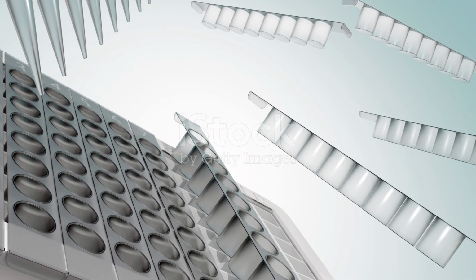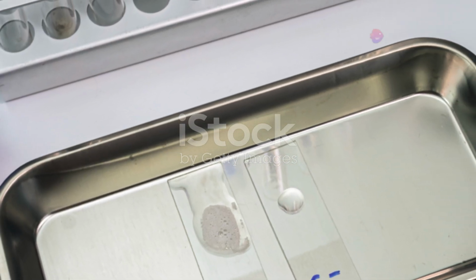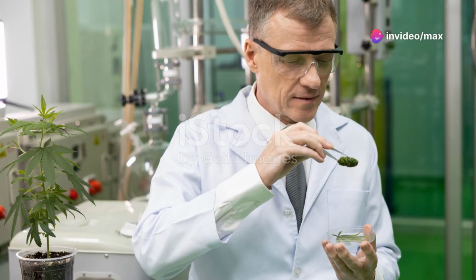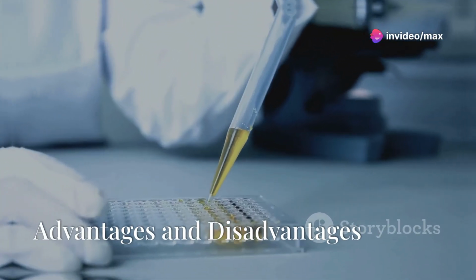Finally, the substrate is added. If the target antigen is present, a detectable signal is produced. Researchers can quantify the target antigen in a sample.